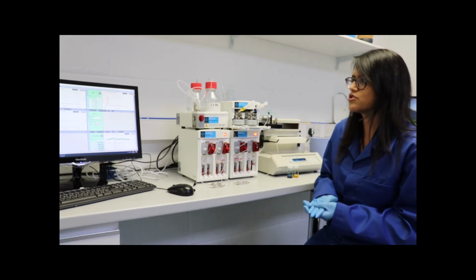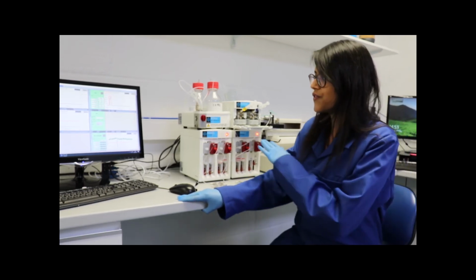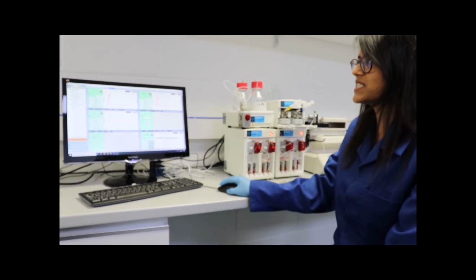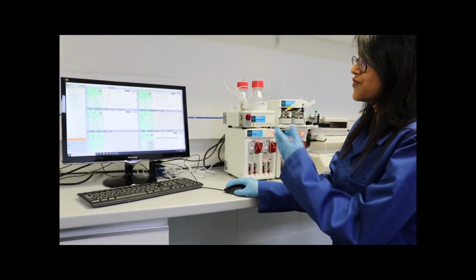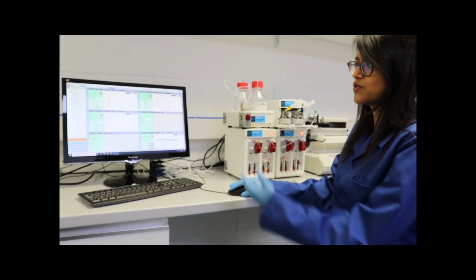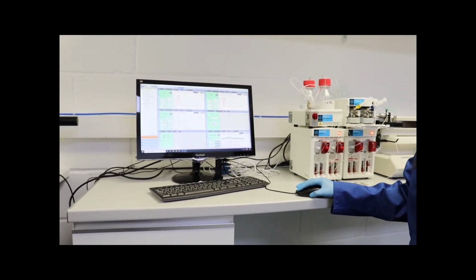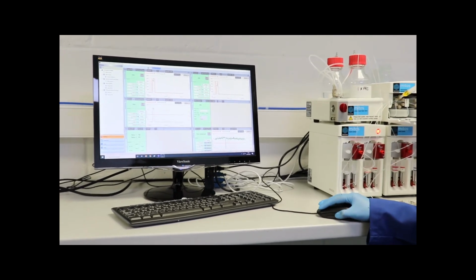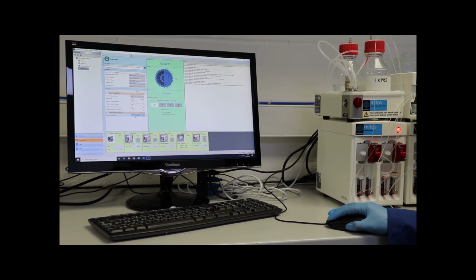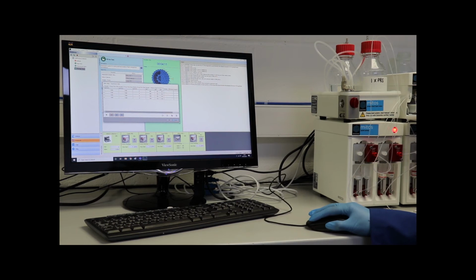So if I take you now to the flow control center, which accompanies the system, all of the components are connected and should show up in the devices tab. Various different windows are open, most of which belong to the 3 syringes, the Gilson collector, and the ASV. When we want to run experiments, we usually go into the protocol mode and into the experimental table. I've already pre-filled this table for us today.